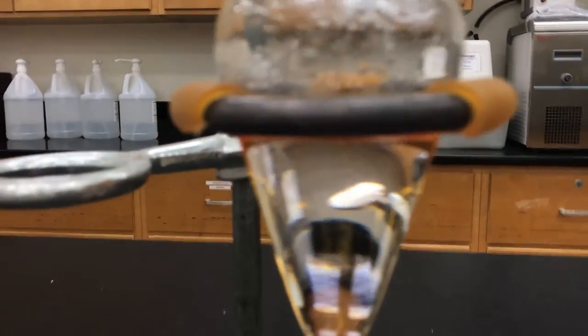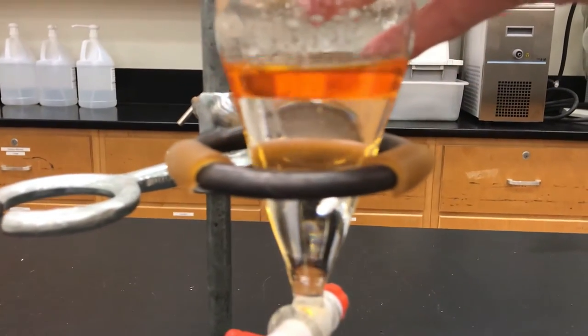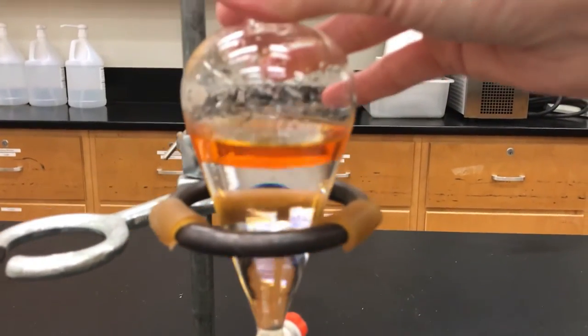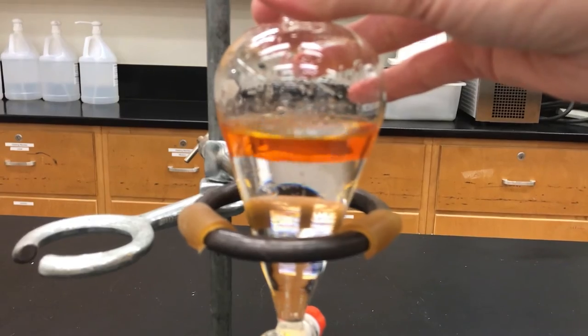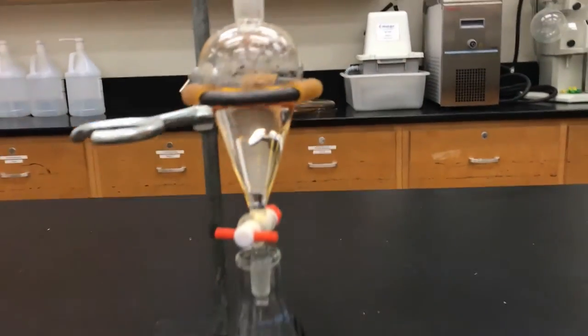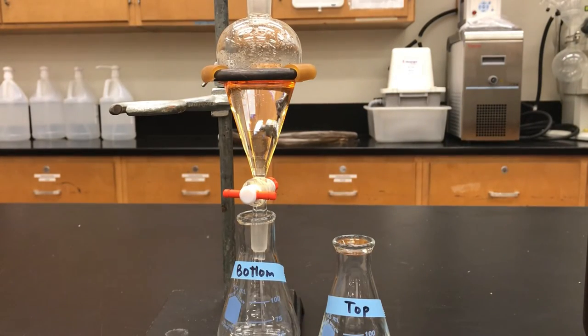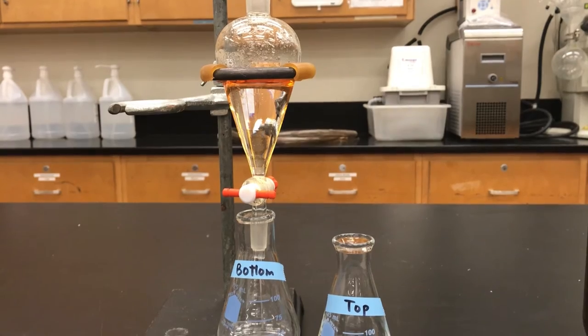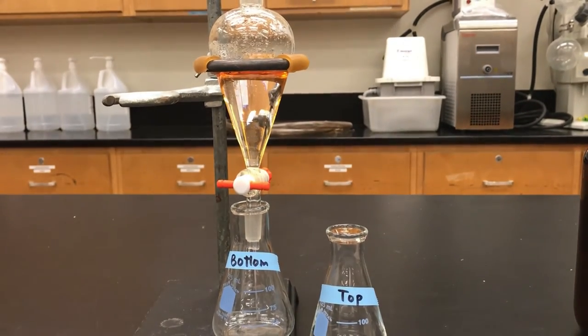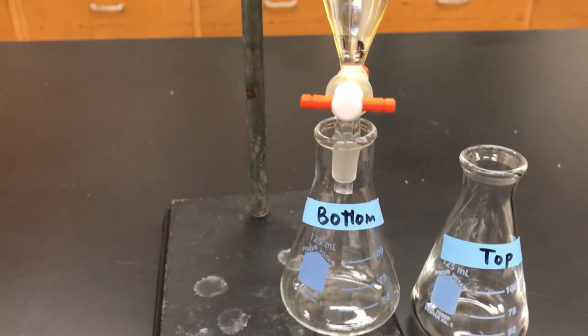Zooming in on the liquids, you can see it didn't take long for everything to settle down and clarify — there's a nice distinct line between the two layers. What I want to do next is separate the two layers into different Erlenmeyer flasks. Get two and label them — I'd recommend labeling one 'bottom' and the other 'top'.